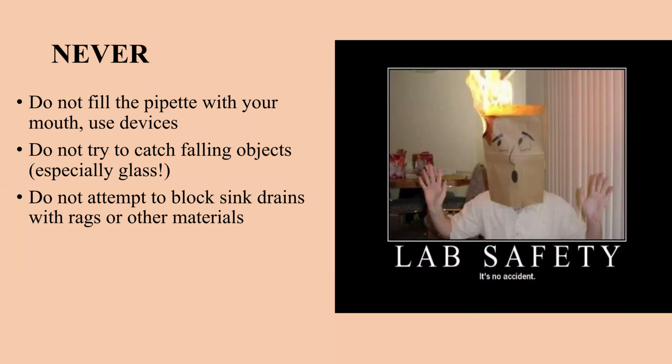It's ridiculous and obvious rules, but in practical life, sometimes we should repeat these simple and single norms. So do not fill a pipette with your mouth. Use a device.